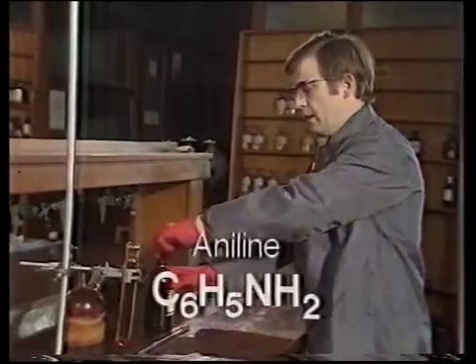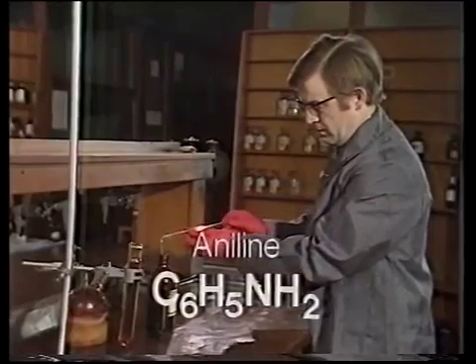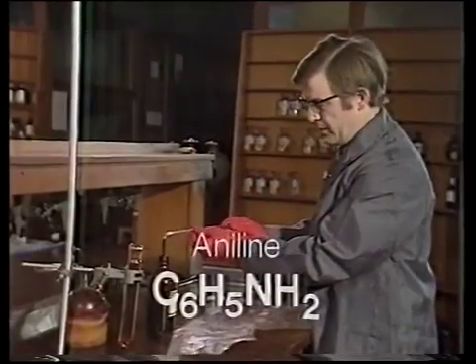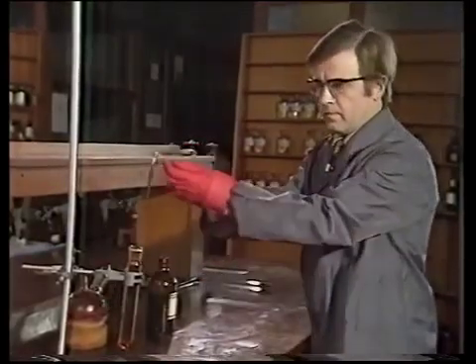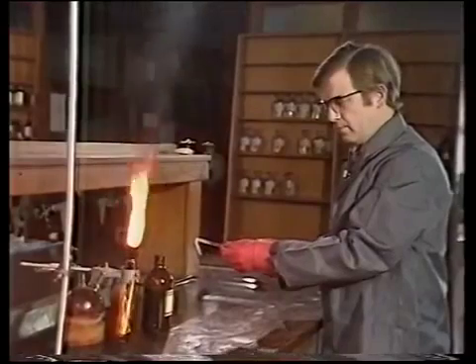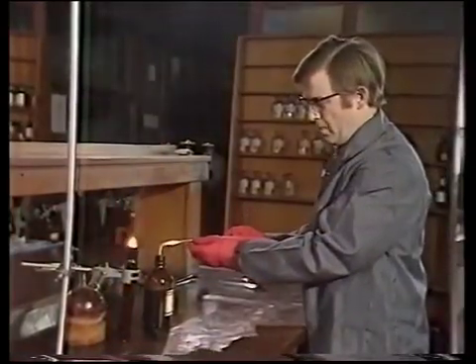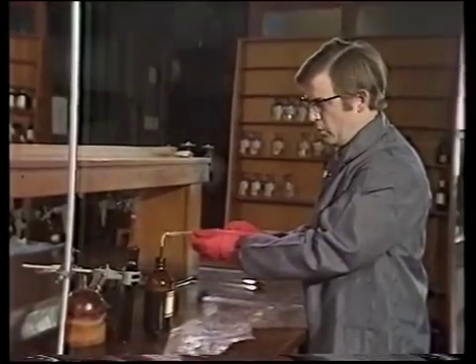Now we can add the aniline. Again, rather carefully because this is a fairly energetic reaction. And it usually proceeds even more vigorously once the tube has become warm.